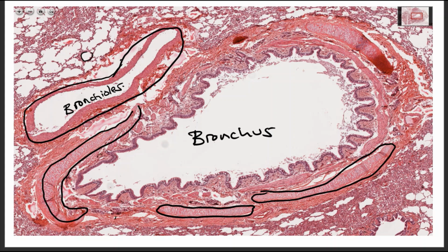What you see here is an air sac. Air sacs are alveoli. A continuation where you have multiple air sacs joining together, but there is no demarcation showing that this is an air sac, is what we call an alveoli duct. An alveoli duct is what leads to an air sac from a respiratory bronchiole.